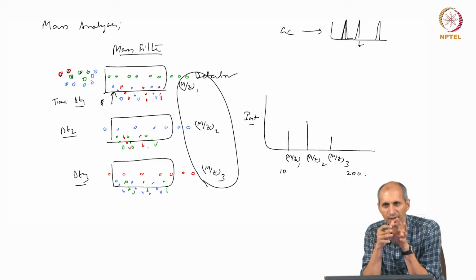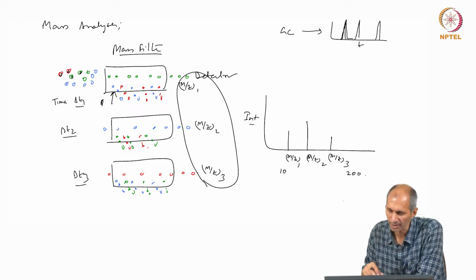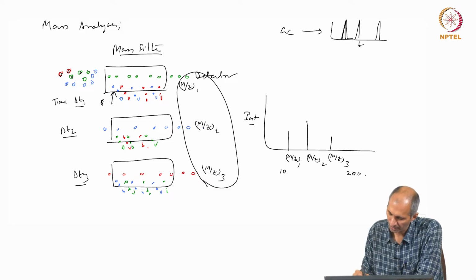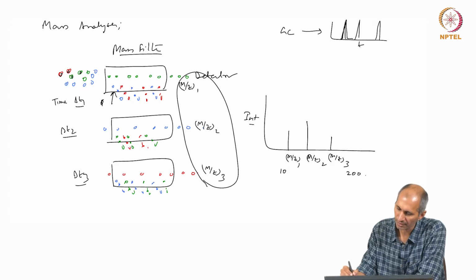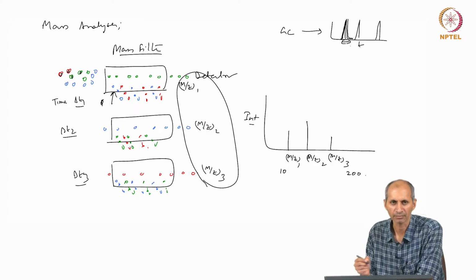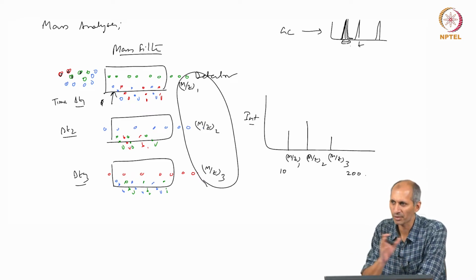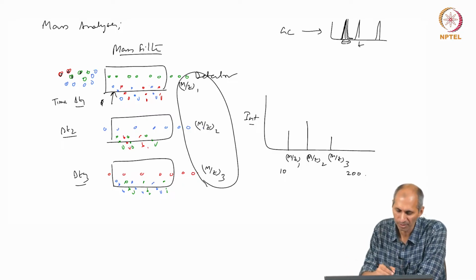There are some things which are fragmentable in the GC energy. If you need to fragment more, you need to go to really high energies, and you do not have that in the instrument here. So, in the range that you are looking at, this is the time that it has. The beginning of a peak to the end of the peak is the speed at which the compound is going. Okay. Within this time, it has to now go and scan everything, all the fragments.